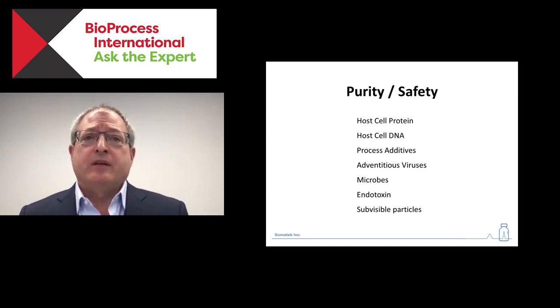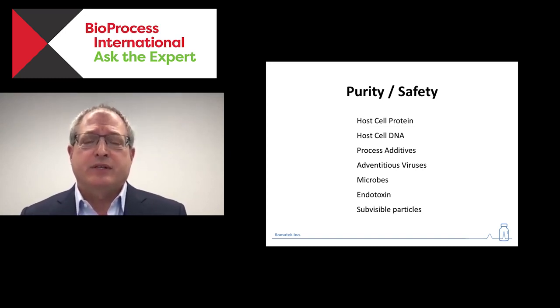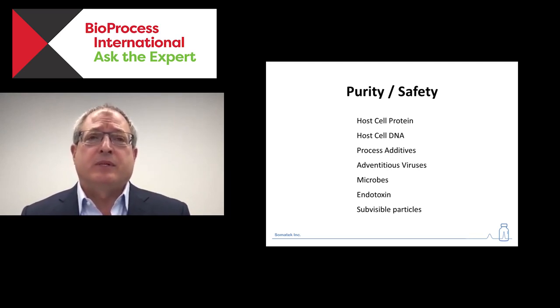Purity, safety, this common cast of characters: host cell protein, DNA, process additives, adventitious agents, microbes, etc. Anybody who's done this could probably triple the size of this list. And again, this shouldn't be much of a surprise to anybody.